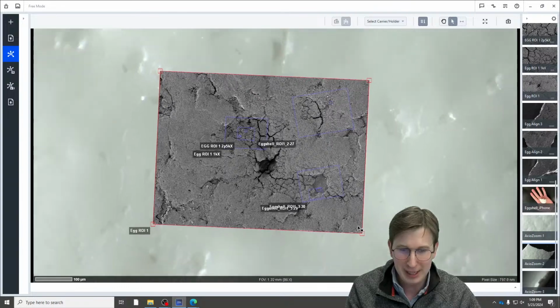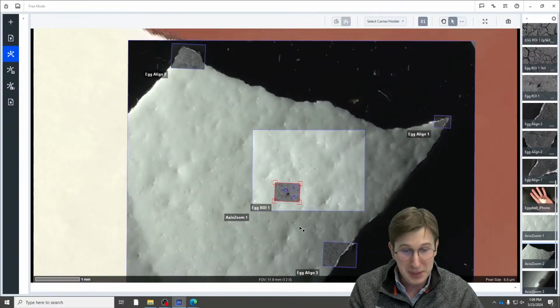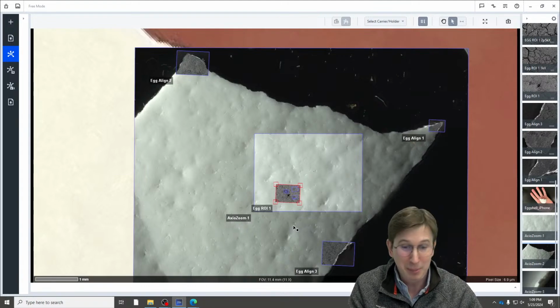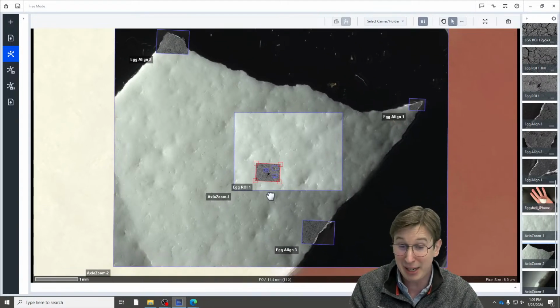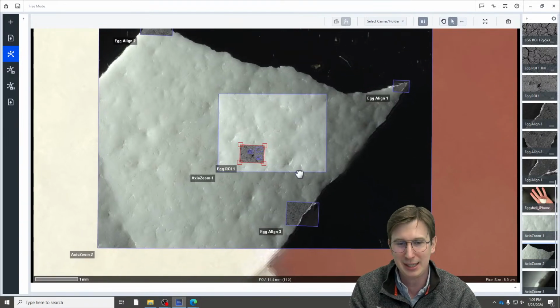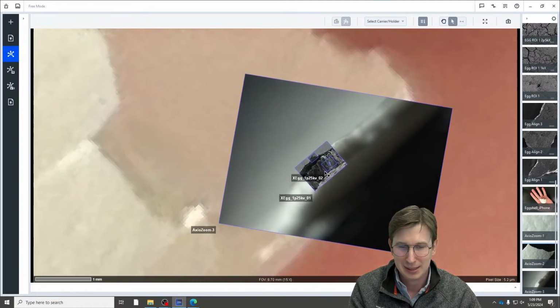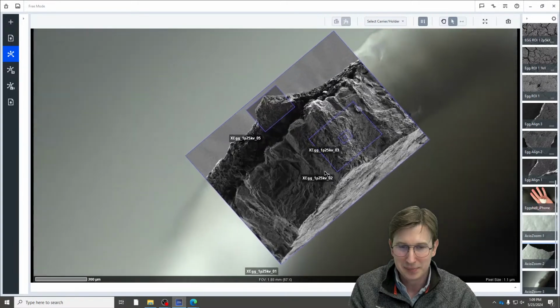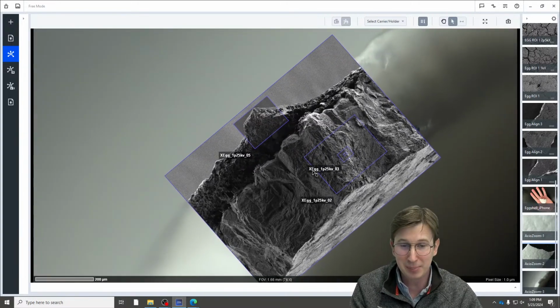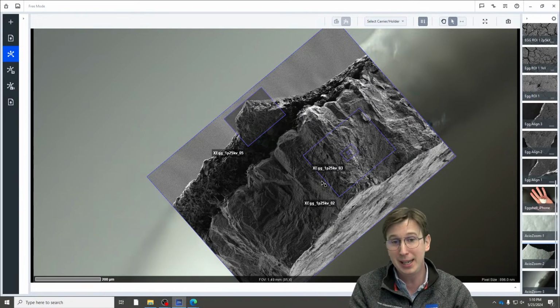But if we're looking at that structure, we need to look at the cross-section. If you're familiar with using a mapping program like Google Maps or something, navigating around your data space here is just the same, right? I'm just using the scroll wheel, panning across, and all the data is in context with it. I'll give you a little peek behind the scenes of how the software is working. Our microscopes, when they take images, know the size of the image and know where the picture was taken.